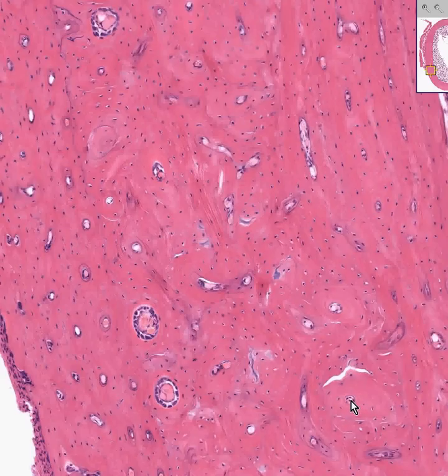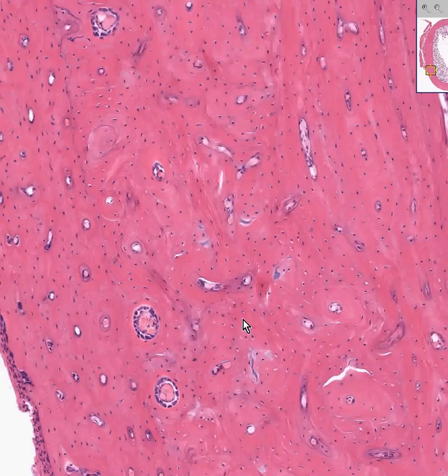Haversian canals are also called the longitudinal canals. Branching off at right angles from these Haversian canals are what they call transverse or Volkmann's canals. All they represent is just some more vascular connections between the main Haversian canals.